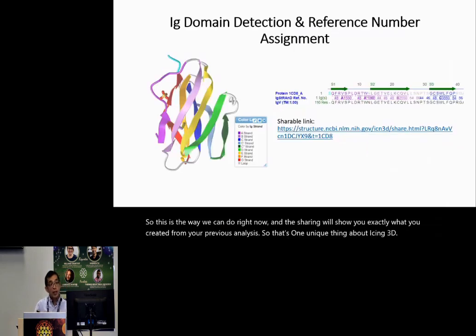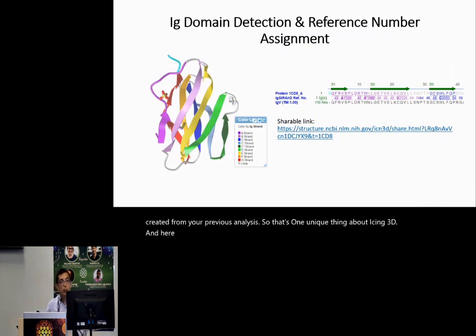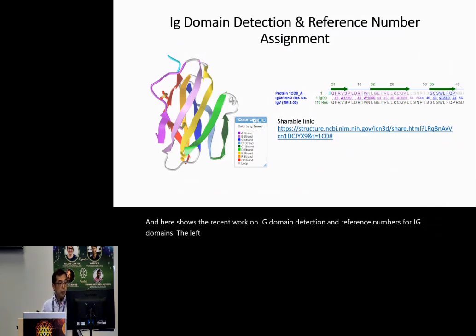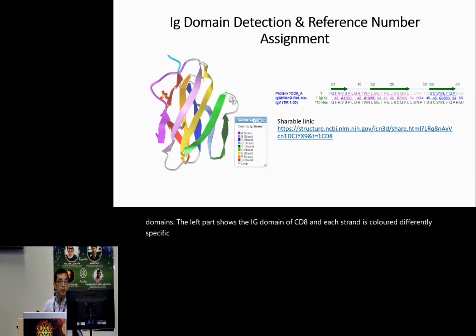Here is the recent work on IG domain detection and the reference numbers for IG domains. The left part shows the IG domain of CD8, and each strand is colored differently with specific colors, so you can tell directly from the color which strand it is.